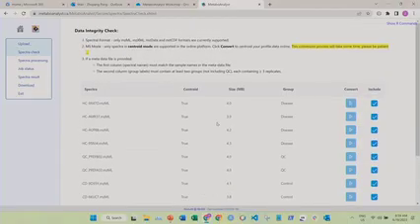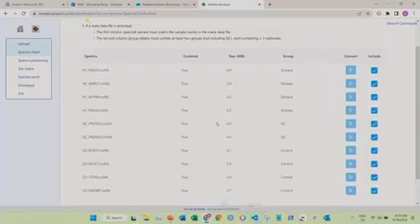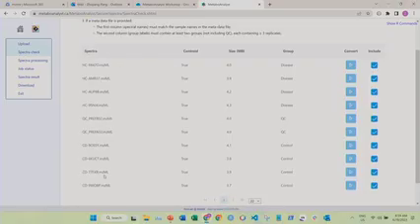So here, this is the data integrity check page. We can see this is the data file we have uploaded. We can show the centroid have been finished by ourselves. So this is the size of the file. We have also provided the group information. If your data is not completely centroid, you can click the convert button here.